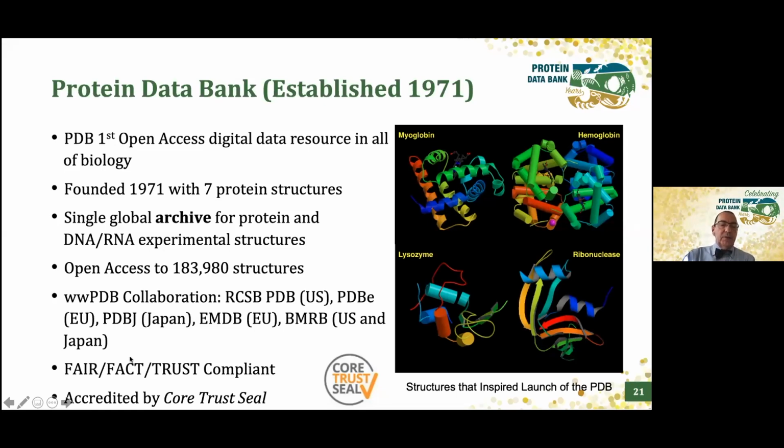It's not an exaggeration to say that the Protein Data Bank was walking the walk when it came to things like the FAIR, FACT, and TRUST principles. And we've actually been accredited, the Worldwide Protein Data Bank has been accredited by the CoreTrustSeal, a non-governmental organization that adjudicates compliance with these principles.